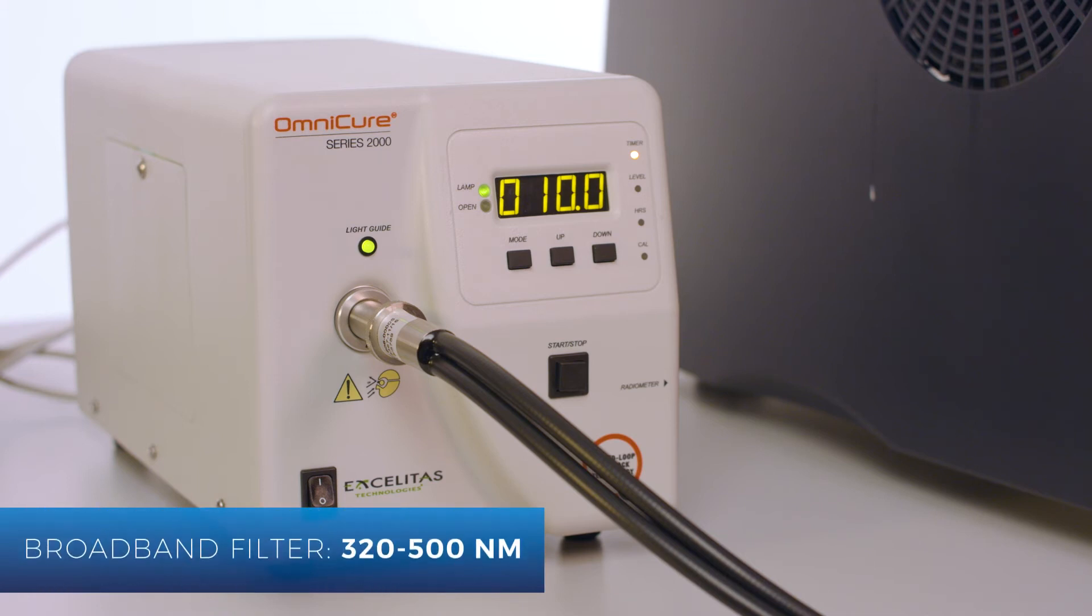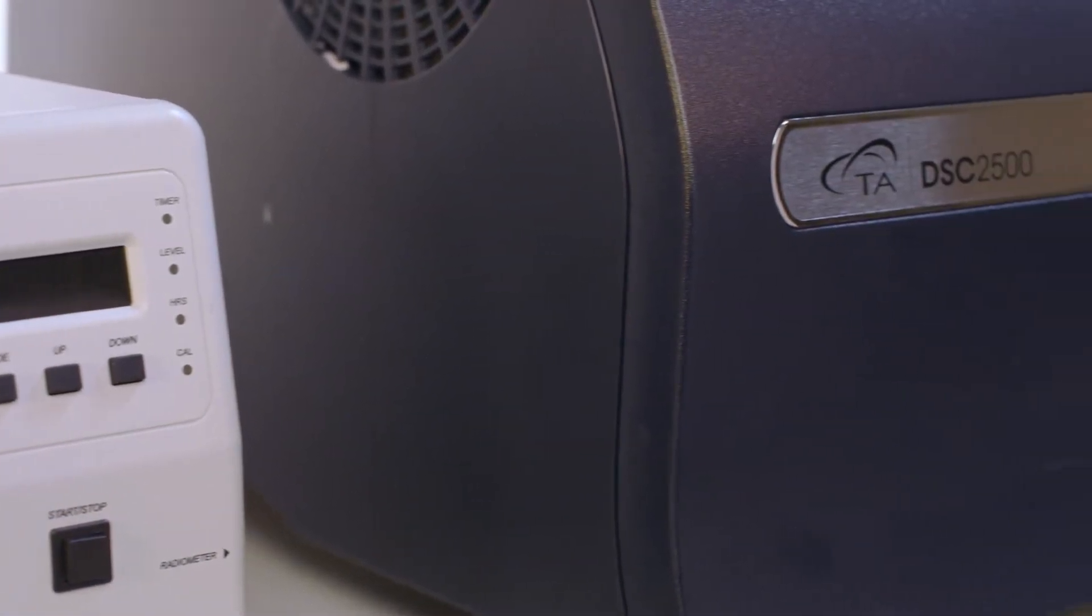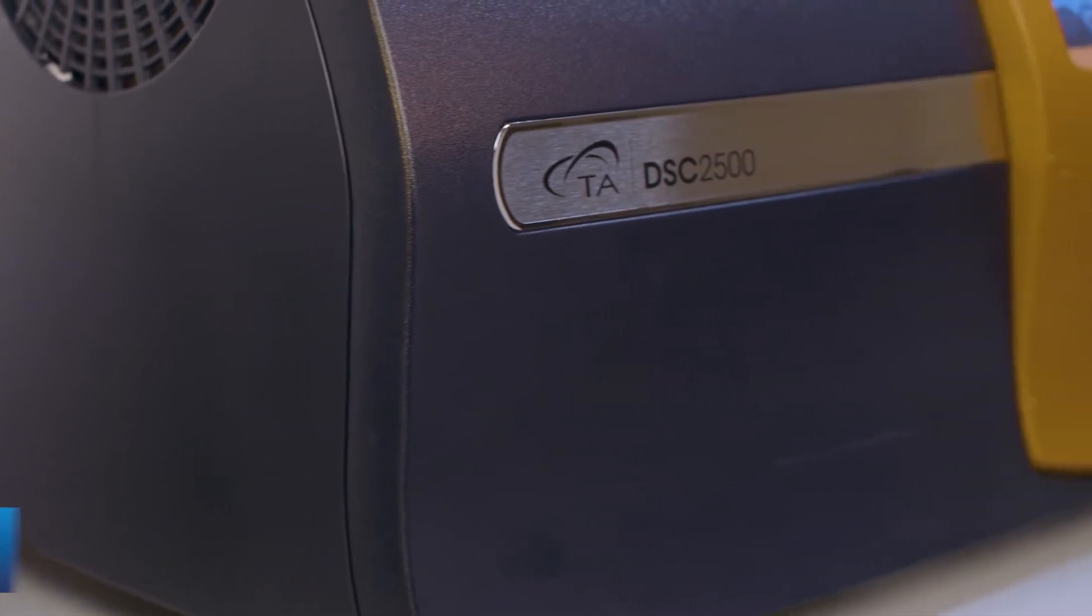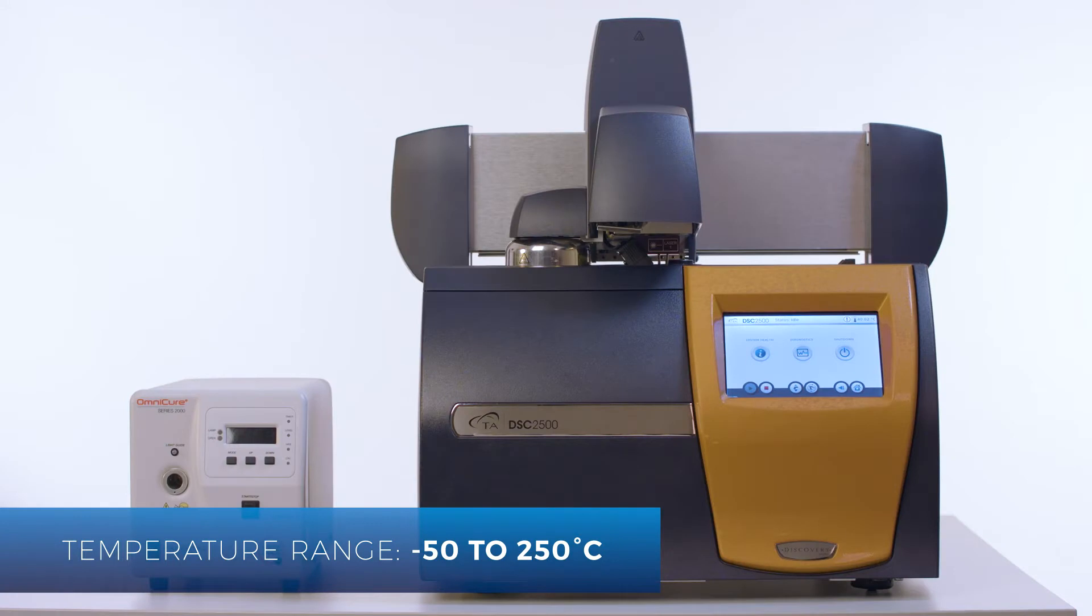A broadband filter 320 to 500 nanometers is provided with the Omnicure. The PCA can be used over the temperature range from negative 50 to 250 degrees Celsius and is compatible with the Discovery DSC using FACS and RCS cooling accessories.